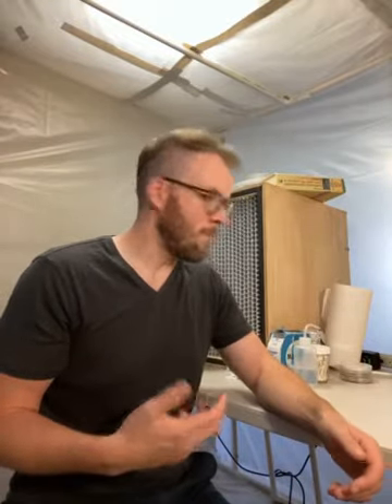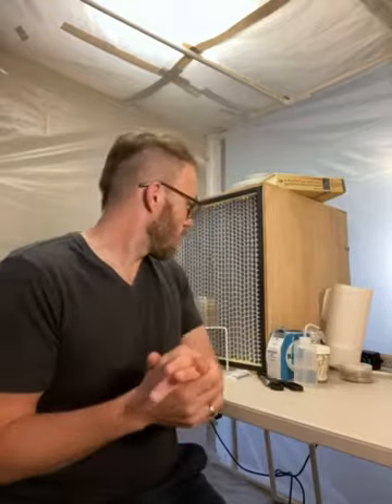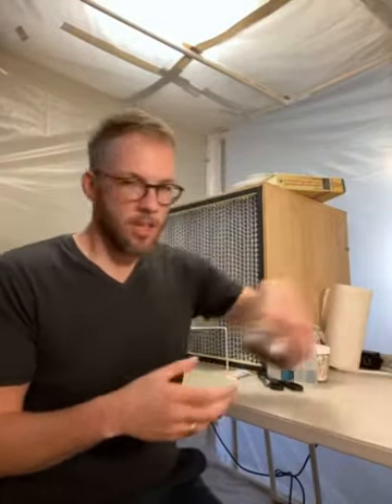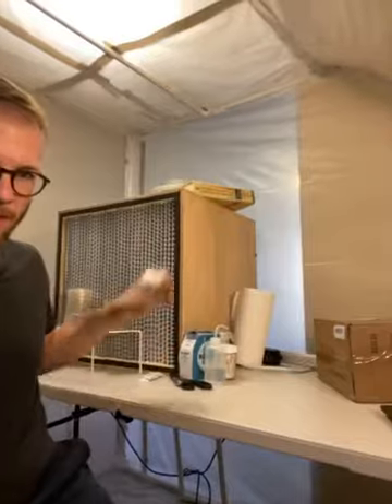A couple of notes about me: I've never owned a microscope and don't think I've ever really used one before. This is another example of something I'm self-teaching as part of my journey learning biological and genetic engineering. I have some curiosities in the world of fungi that have prompted me to get a microscope. I'm actually in my lab right now — this is my flow hood here.